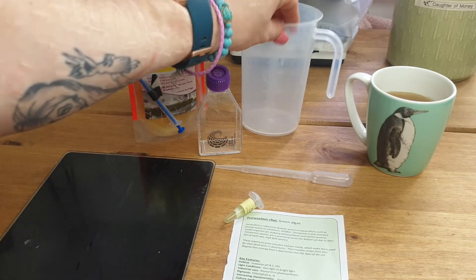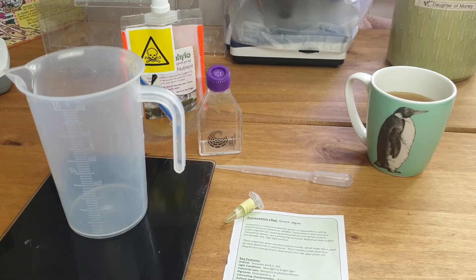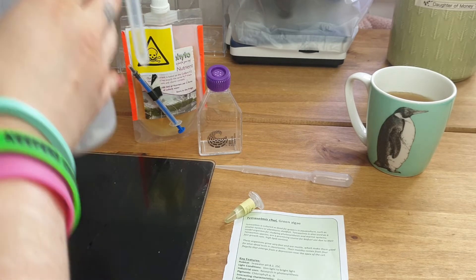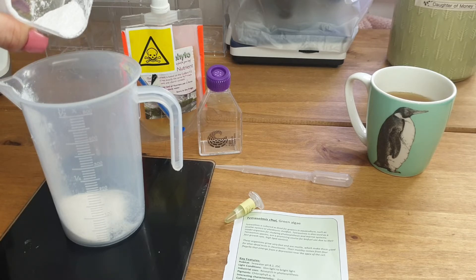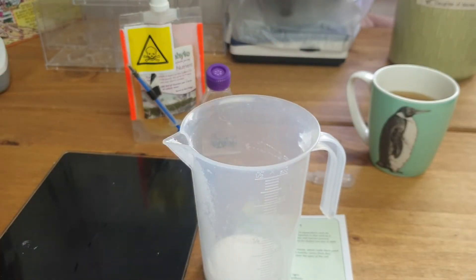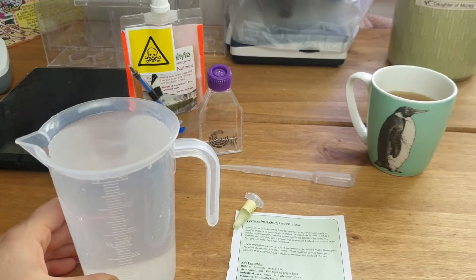So on the weighing scales, put the jug on them and zero those. We want 16 and a half grams. I've got the tub of ocean salt and a little container — that's already too much at 25 grams, so we're going to take some of that out. That's 14... 16. There we go.